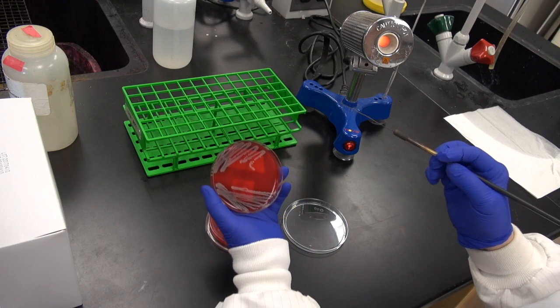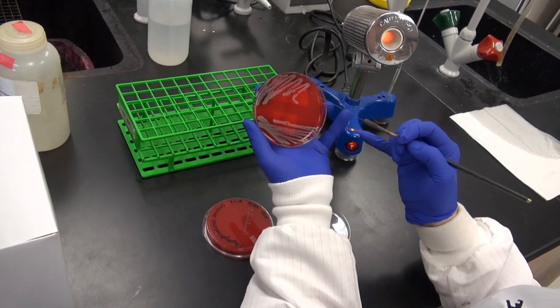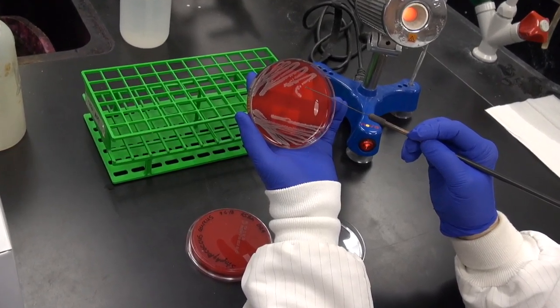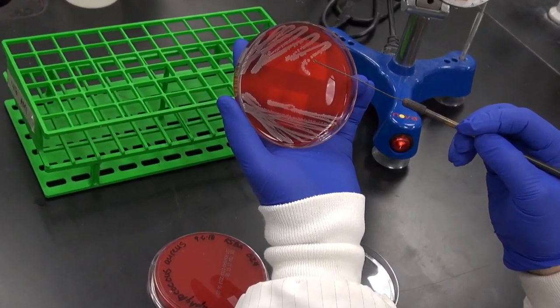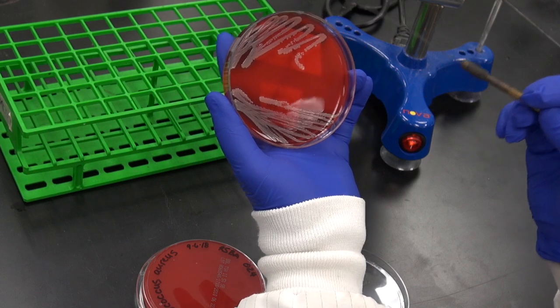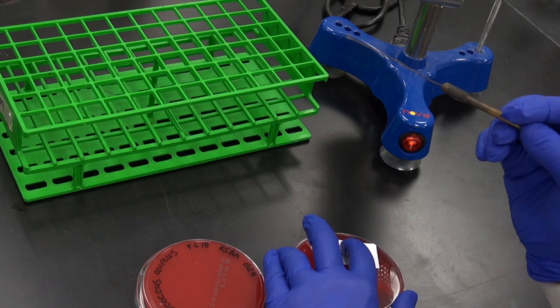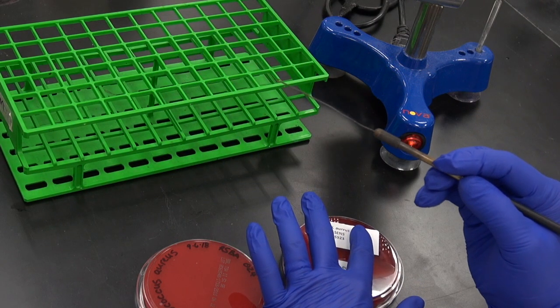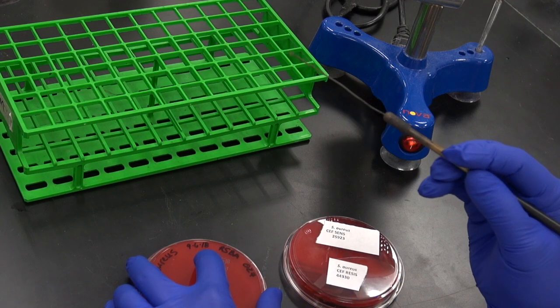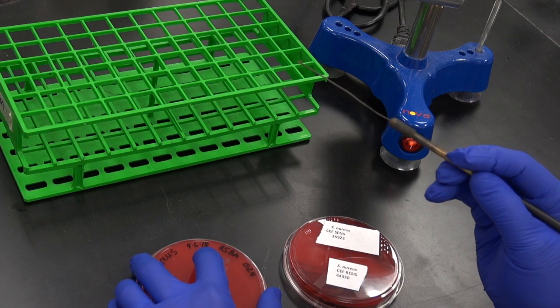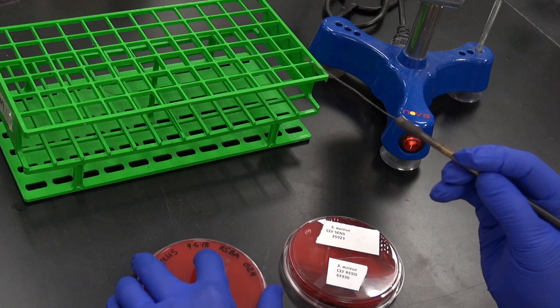Still holding the loop in our dominant hand, open the original culture plate by lifting the agar side of the plate and holding it in your other hand. Touch one isolated colony with the loop to pick up some bacteria. You don't need very much, so just touching the colony with the loop will give you plenty. Close the plate to avoid contamination from the environment.